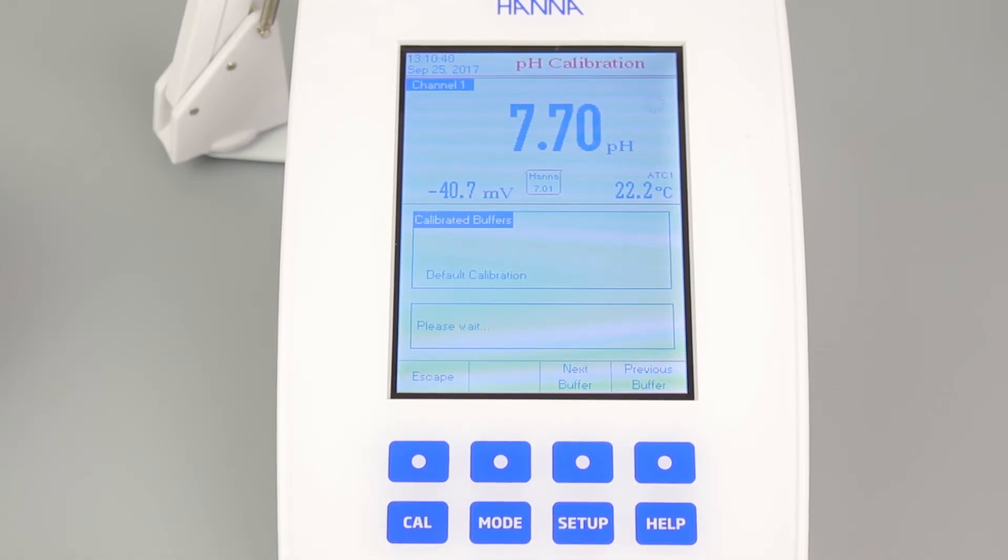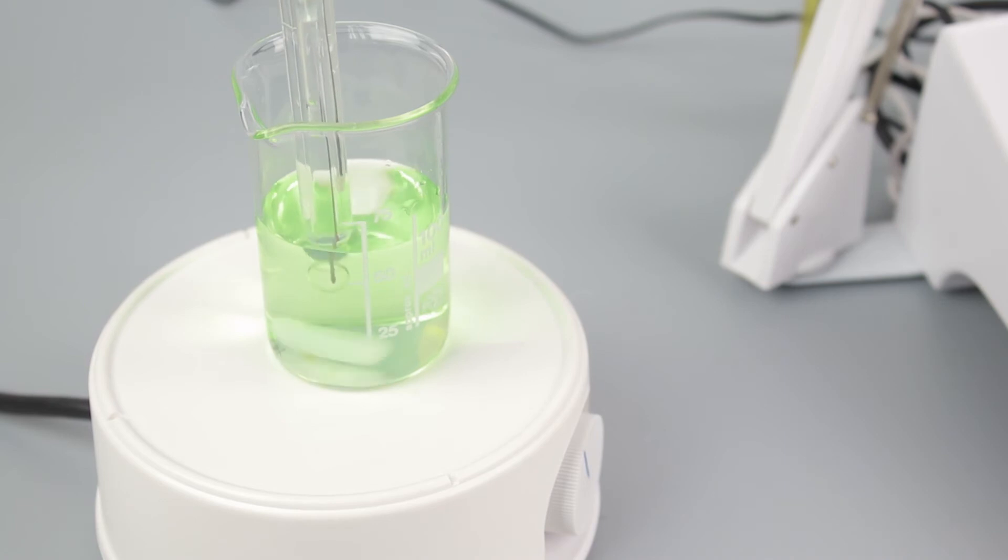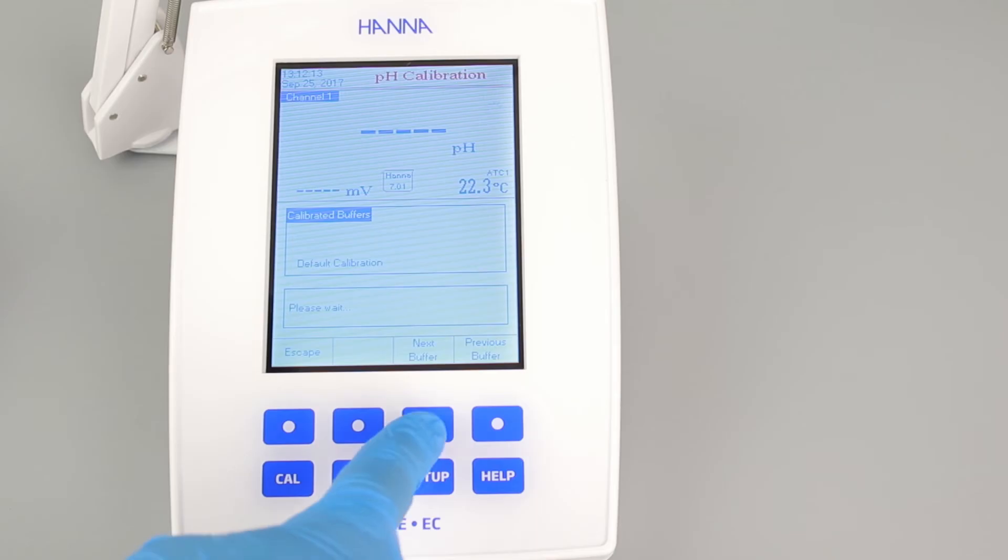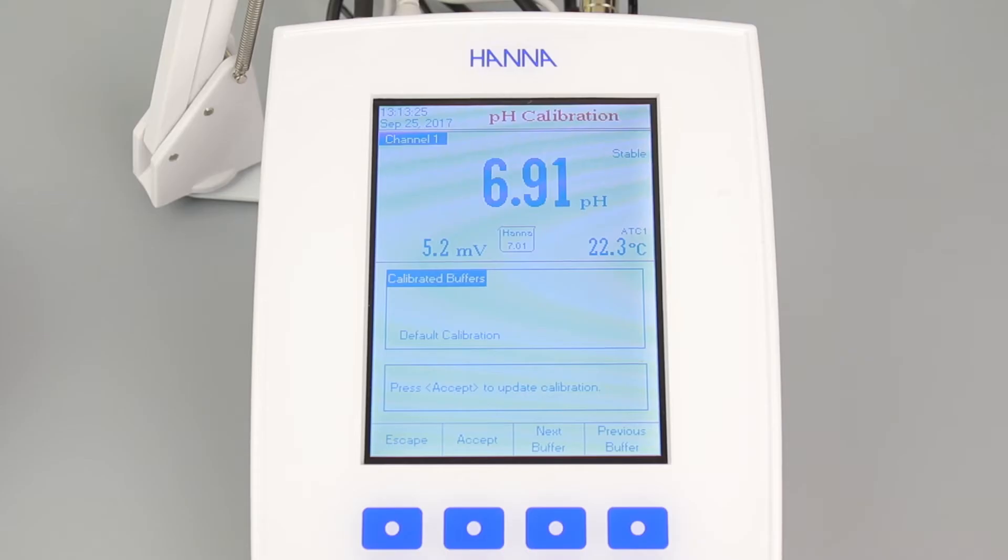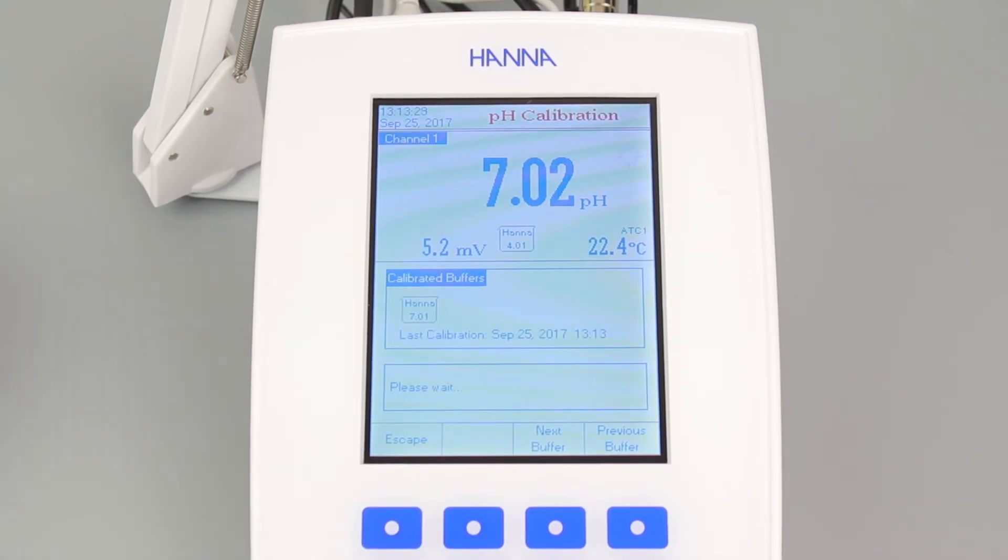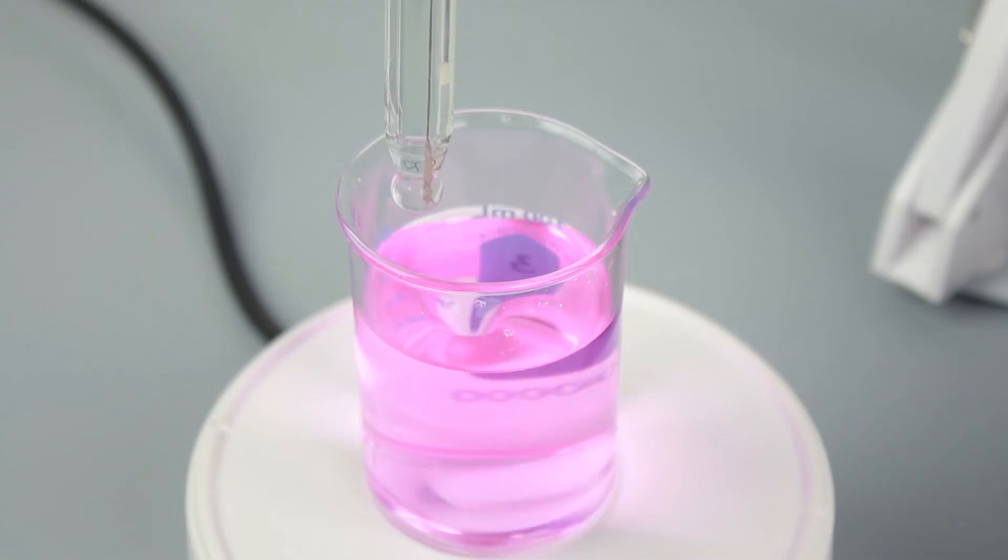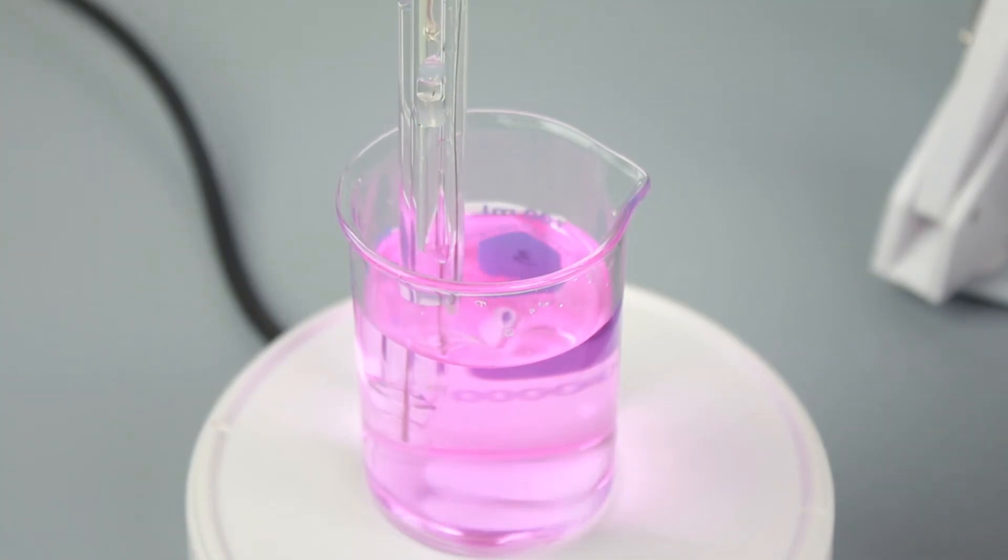To calibrate your meter, press the CAL button. Then place the pH electrode into your buffer. Make sure the sample is stirring. Use the next buffer and previous buffer buttons to match the value you're using. Once stable, press accept and the calibration will be saved. Your meter can calibrate up to 5 points. Place the electrode in your next buffer or hit escape when you have finished calibrations.